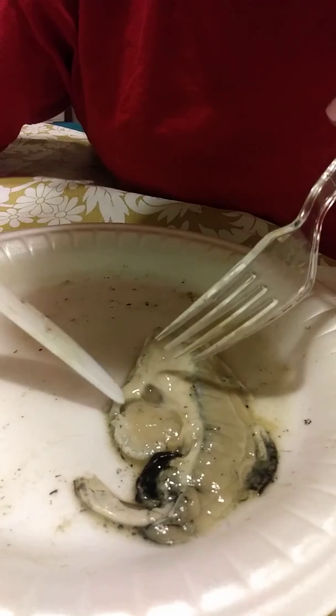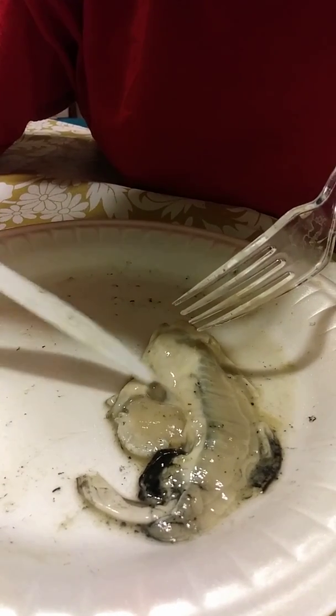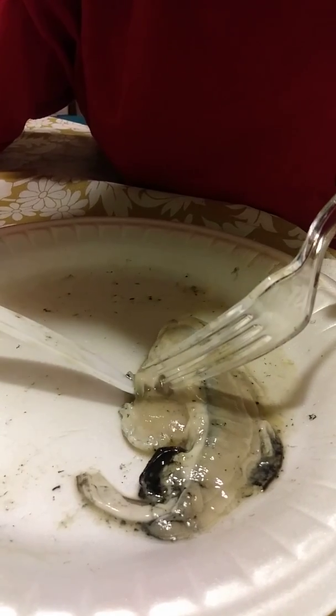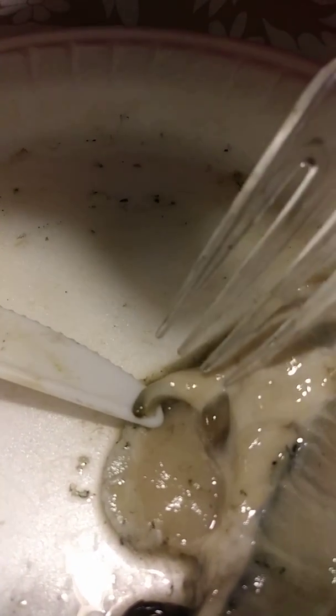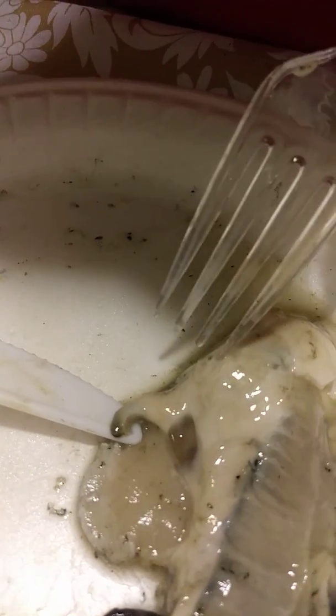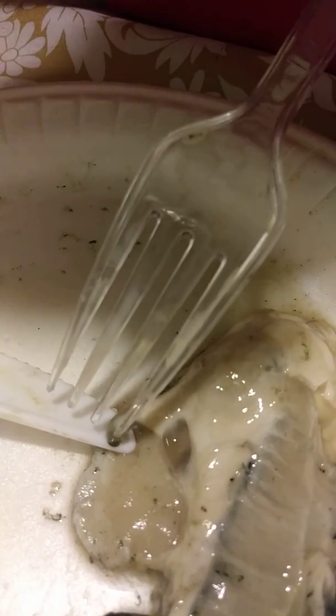This is the rectum. This tube right here is his intestines. That's the intestinal tube. And the bottom part here, this little black part at the tip, bring it closer. The black tip is the anus. So the tube, this whole long tube here, comes from the stomach. And the tube flows. That's the intestines, and the end is the anus.